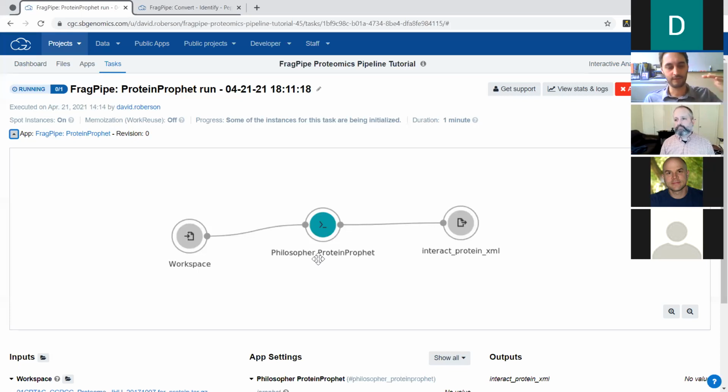That will give me one set of proteins that will be the same for all experiments, but they will be filled with different values for the quantification, because the quantification is relative to the peptides that were found in each experiment. So if you do the protein inference individually for each experiment, you will have different lists of proteins, and that will be pretty hard to do any comparison.